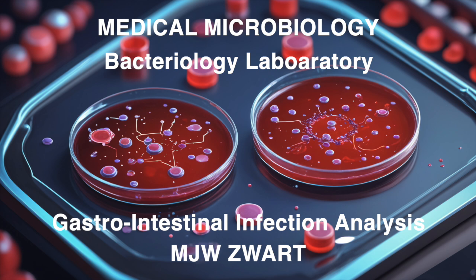Now comes the fun part. We get to examine those colonies. We look for clues that tell us what they are. Size, shape, color, texture, it's all there. Like a secret code. Oh, I like that. So what kind of cool codes did Gemini find when looking at colony morphology? Well, for one, did you know that Yersinia enterocolitica can look like a bullseye on CIN agar? Really? Yeah, it's like a little target. And then there's Campylobacter. Sometimes it has this metallic sheen on CCDA agar, like a tiny mirror.